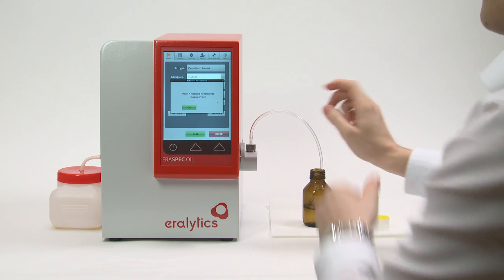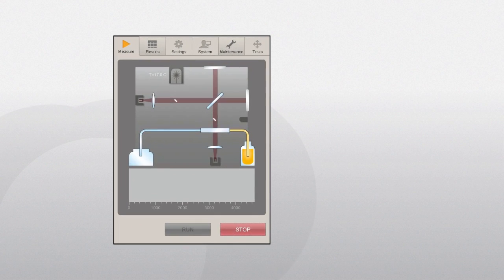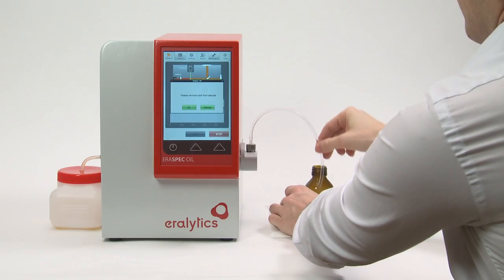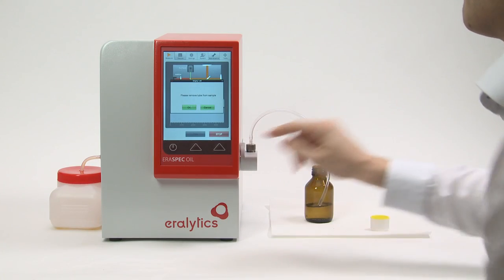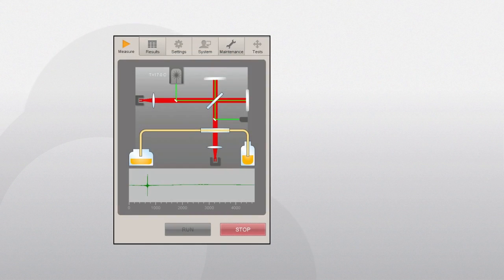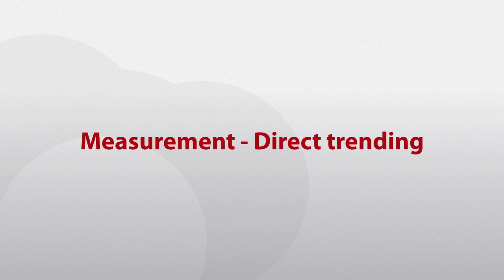The fluid will be automatically pumped into the cell and the automated measurement sequence will be activated. After the scan has been completed, the pump will be activated once more to remove the fluid from the system.